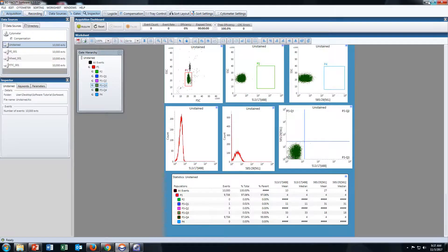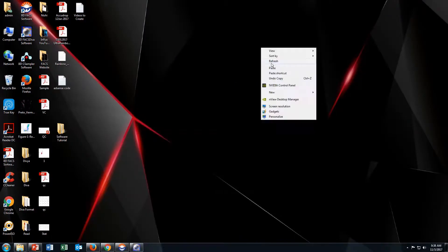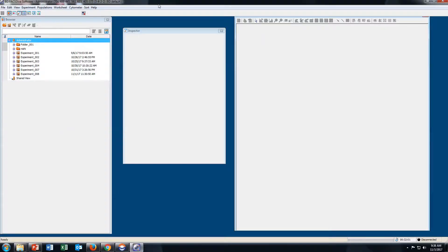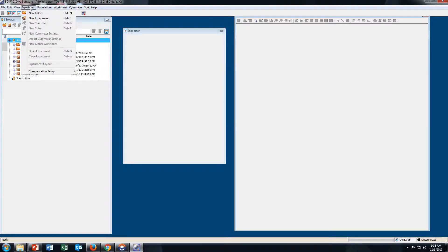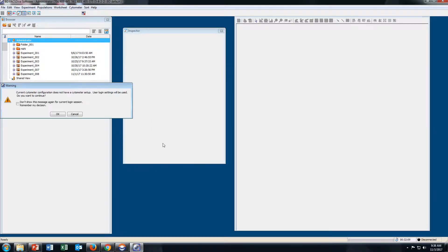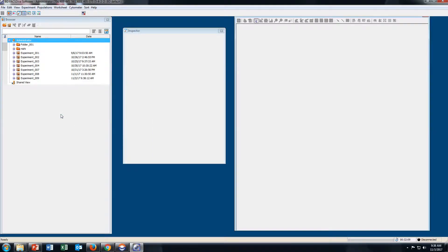Now open BD FACS DIVA software. Go to Experiment, New Experiment, Blank Experiment. Click OK, then OK.